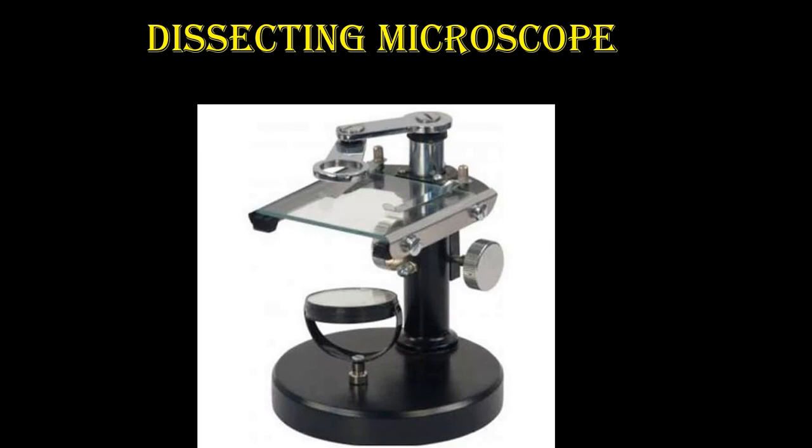Structure of the dissecting microscope with stage, then convex lens, and the adjustment screw and the particular structure on the arm to hold the lenses, or we can change the lens with the help of the adjustment, depending on the requirement of the purpose or the image to be observed.